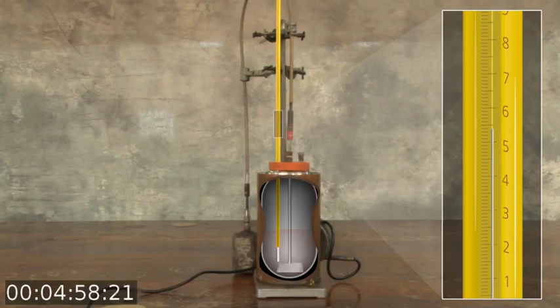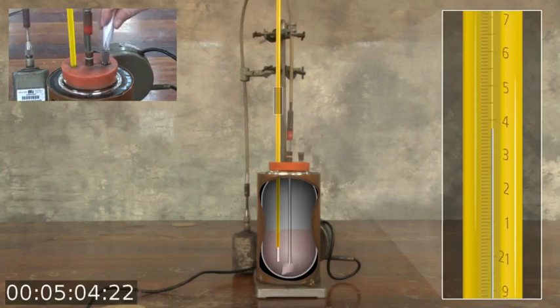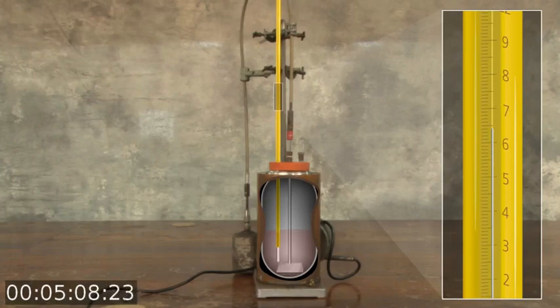On 5 minutes, we add the manganese dioxide through the open glass tube in the lid to catalyze the decomposition. The temperature rises rapidly once again. By 6 minutes, the reaction should be complete.